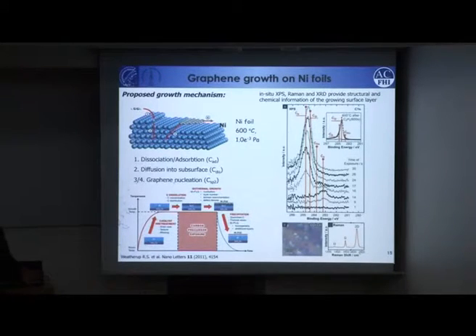It's the same with nickel. Nickel has a very high solubility of carbon, so lots of carbon can go into the bulk. Then with time it comes to the surface, you see a peak shift again, and they have the graphene. But this is just a spectrum, so they thought from the spectral energies how it should happen. That was the ramp they were driving: they heated up a sputtered film to make it first polycrystalline, then they did isothermal deposition, or CVD process, and then they were cooling down.